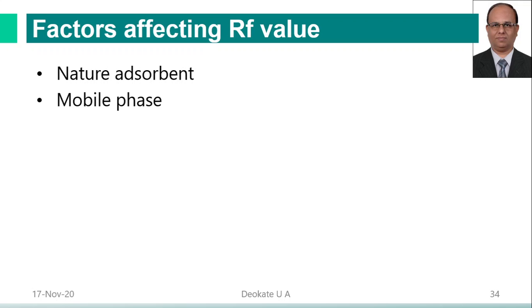The second factor is the mobile phase. The purity of the solvent and the quantity of the solvent mixture should be strictly controlled. It should be made freshly for each run. If one of the solvents is very volatile or hygroscopic, for example acetone, care should be taken. The third factor is temperature. Although precise control of temperature is not necessary, the tank should be kept away from sources of heat, direct sunlight, etc.